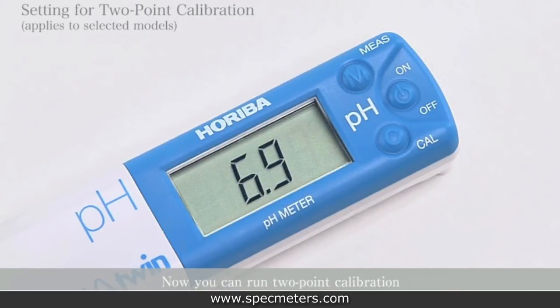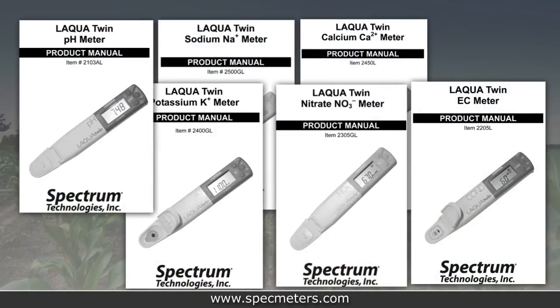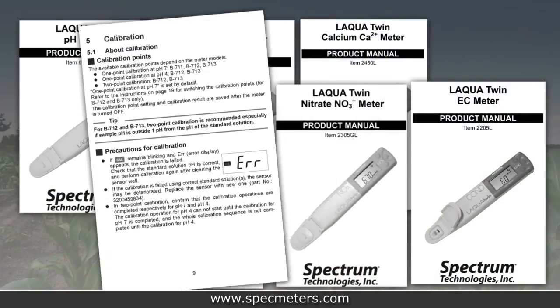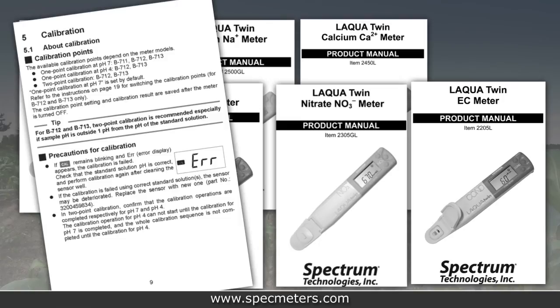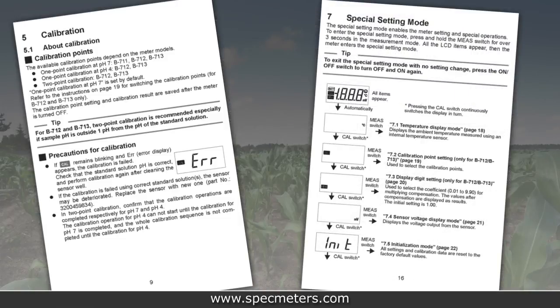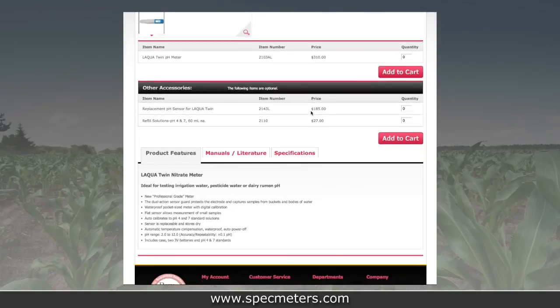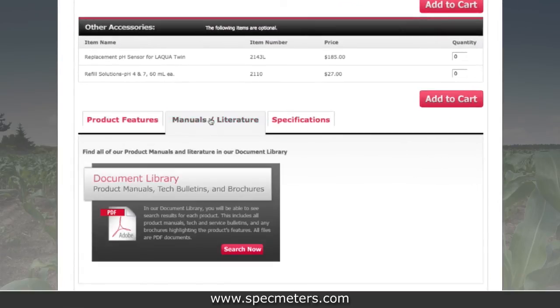Press the measurement switch to apply the setting and the meter will return to measurement mode. You can now run two-point calibration of the meter. Please refer to the specific product manual for your meter — this gives you the order of which solutions to use first. Each meter can also be set to read in different measurement units; please see the special setting mode in the product manual. The product manual comes with the meter, but can also be viewed and downloaded from our website.